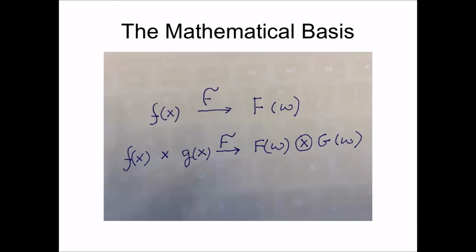And you have a convolution of the Fourier transform in frequency of the sample and the Fourier transform in frequency of the additional grating. I'm sorry, I didn't tell you that, it's a grating that you impose on your sample. So this is a grating really, okay, with higher frequencies that you impose on your sample, and you get a convolution of the sample Fourier with the grating Fourier.